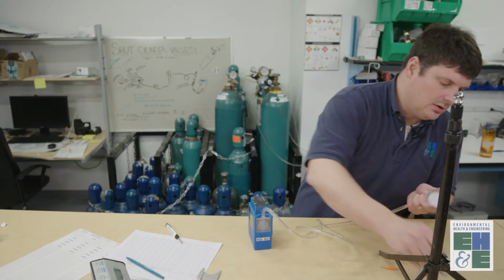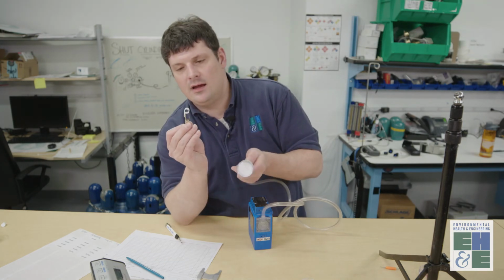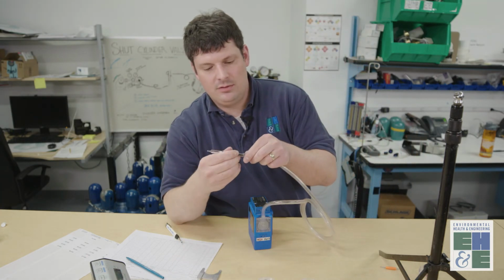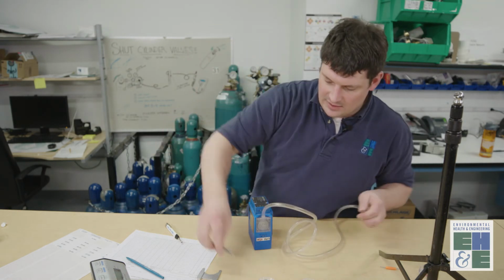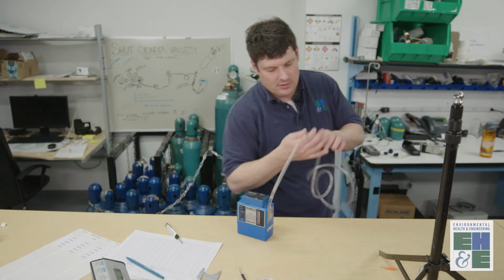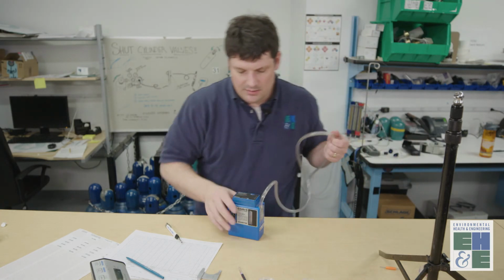There are also holders that look like this that attach to the tubing here and then go in the breathing zone on the lapel of the worker. Same thing with the sorbent tube. Oftentimes, these pumps can actually connect to a belt and then go over the shoulder of the worker and onto the lapel.